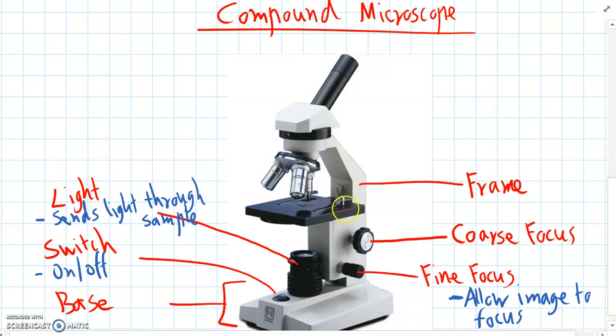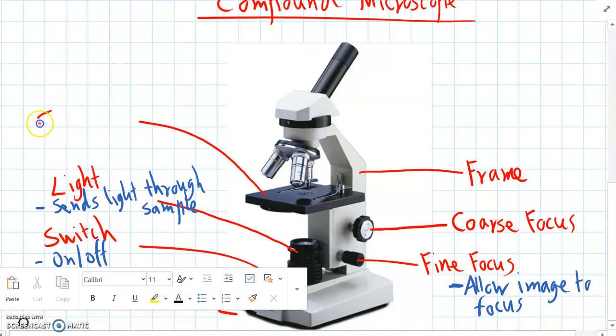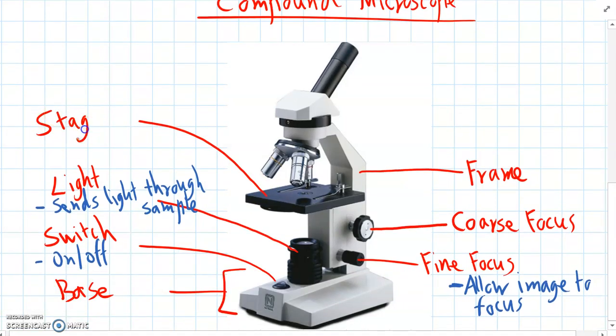Then moving up attached to the frame as well, we've got the stage up here. That's this black tray here.